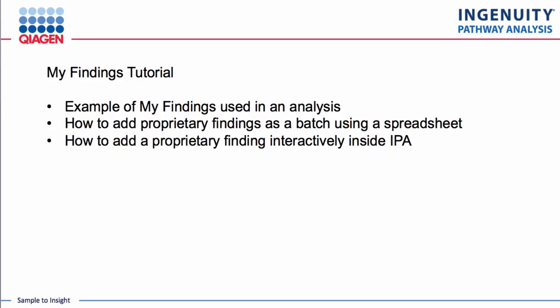In this video, I'll show you how to use my findings in IPA. I'll show you an example of using my findings in an analysis. I'll show you how to add proprietary findings as a batch using a spreadsheet, or how to add proprietary findings one at a time interactively inside IPA.